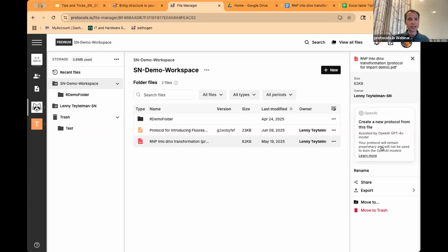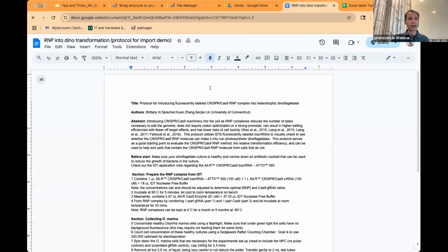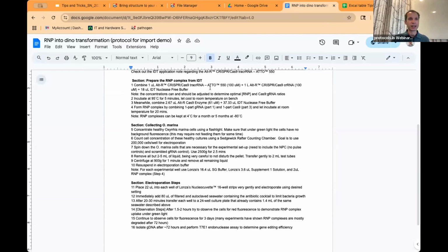It doesn't know where the steps are, what the warnings are. So it does fail sometimes, but 90% of the time it does a very good job. You still need to check it and make sure that it didn't miss anything, but it is a big time saver.